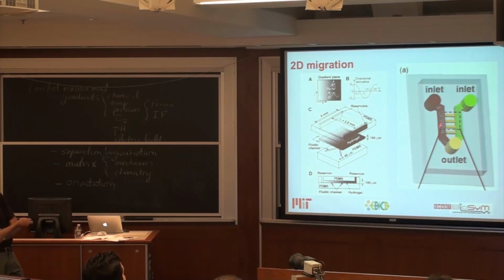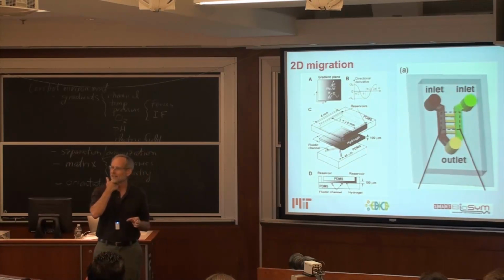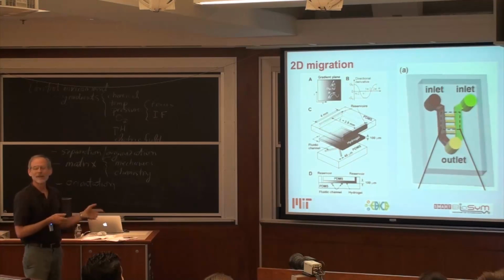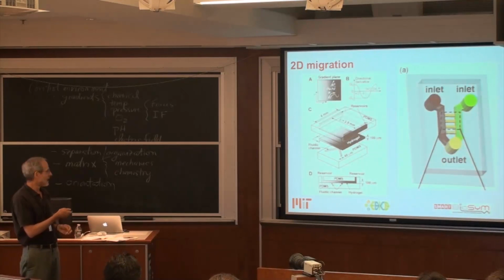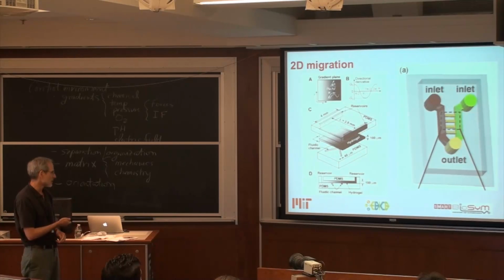Here's one again, chemical A, chemical B, and then in these channels between, which are small enough so you don't get a convective flow through them, you can generate a gradient. And I know in the lab you generated a gradient yesterday, and you know how difficult it can be to get a nice gradient. Everybody experienced that, I think. These are all ways in which people have tried to do this, and not even within a gel. All of these that I've shown you so far are simply in channels, so the cells are migrating on the two-dimensional surface.